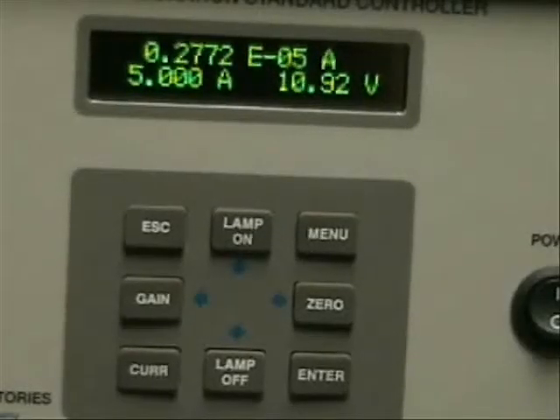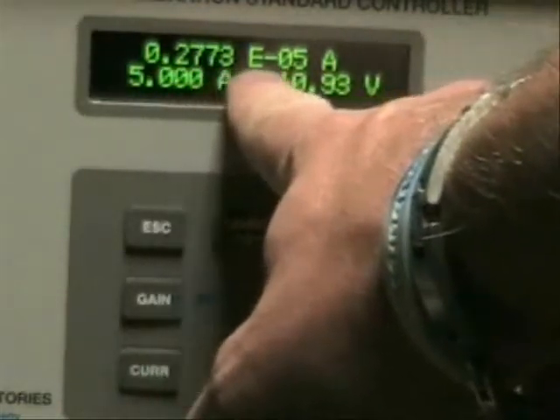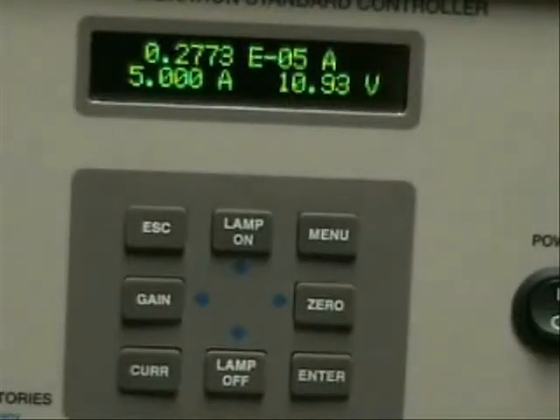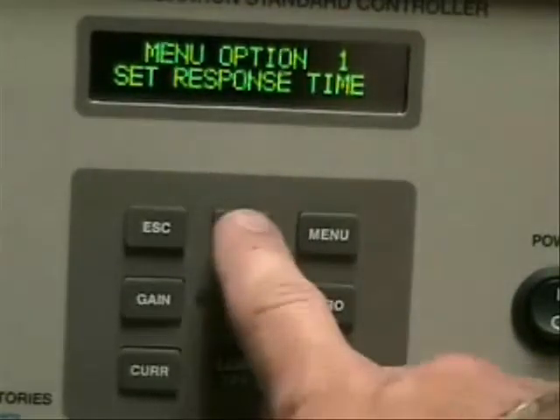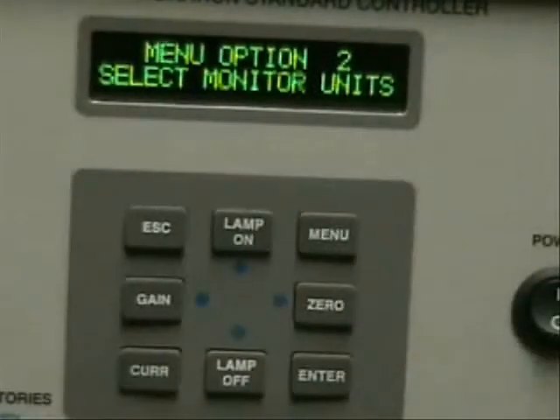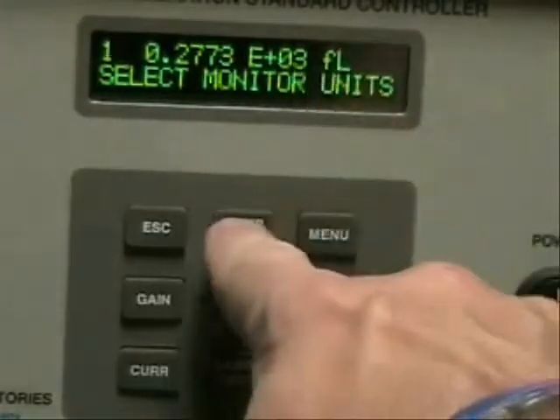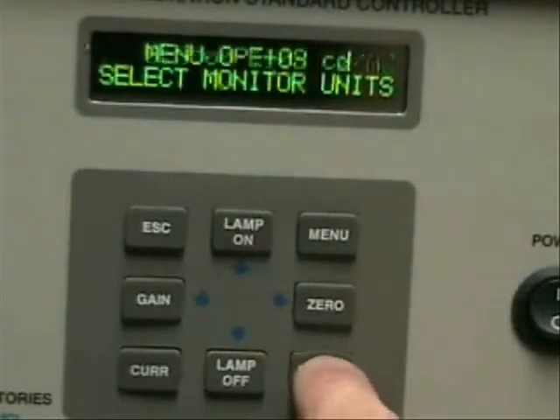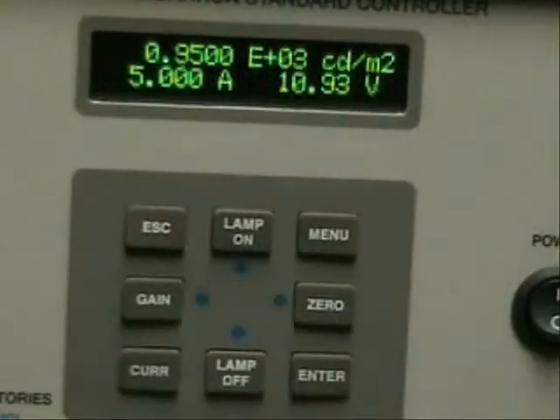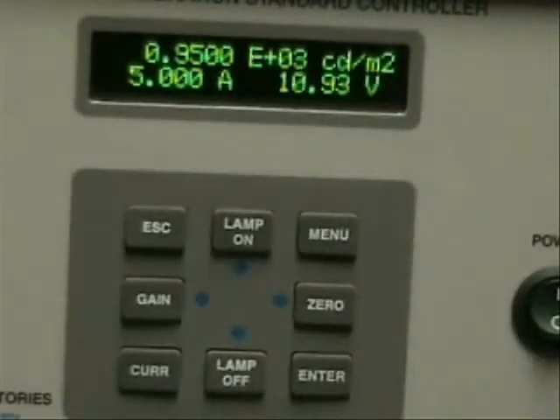One final note: if you'd like to change the units in which intensity is read — right now we're reading in amps at .2773 e to the minus 5 amps — simply press the menu button. You'll scroll using your up and down arrows to select monitor units, then hit enter. By hitting the up arrow again, you'll get either foot lamberts or candelas per meter squared. Hit enter and exit. We're back to our original screen, and as you can see, we're now at .9500 e to the plus 3 candelas per meter squared. That's a simple explanation of installation and operation of the OL455.